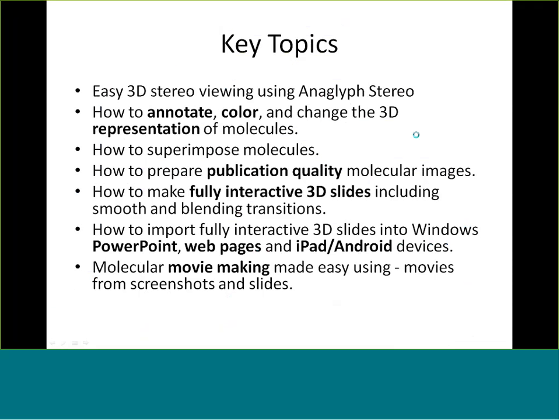So the key topics for today are a new feature as part of our software, easy 3D stereo viewing using Anaglyph Stereo. I'll show you how to do that. How to annotate, how to read in protein structures and other molecules, color them, and change the 3D representation. How to superimpose molecules. How to prepare publication quality molecular images.